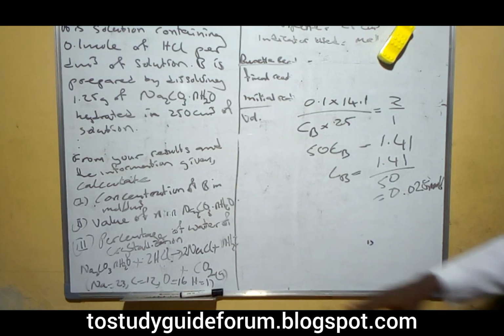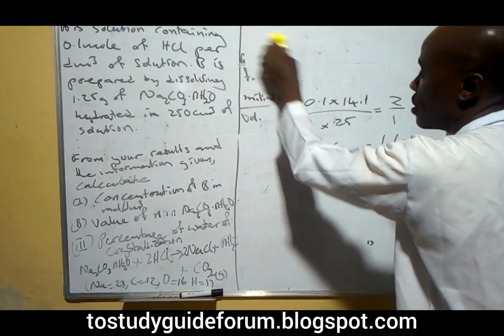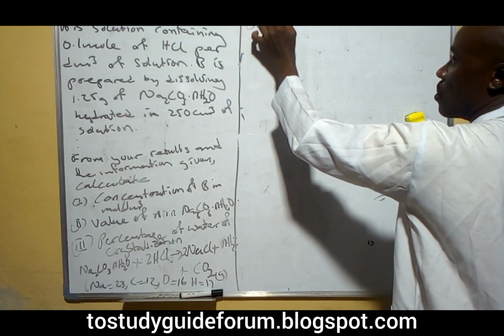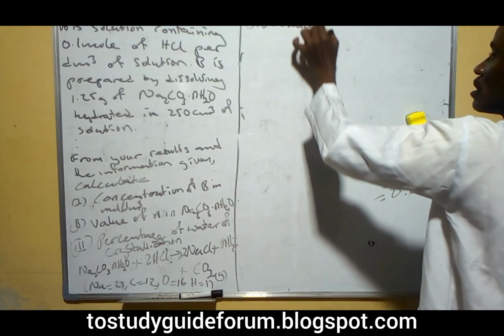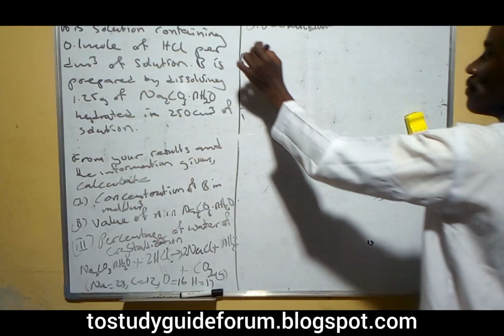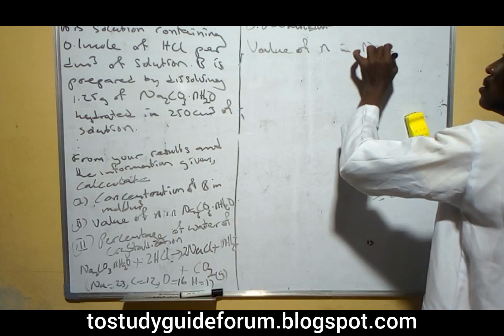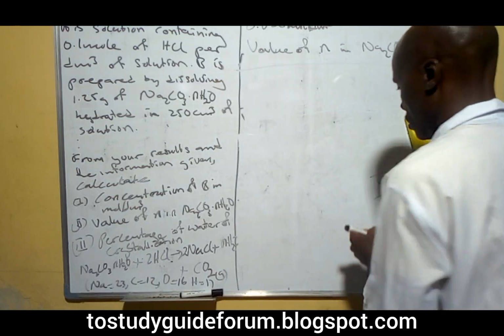So the next thing we are going to do now is to calculate the value of n in the formula. We leave this in here, so we'll come over to this page to calculate the value of n in the compound.